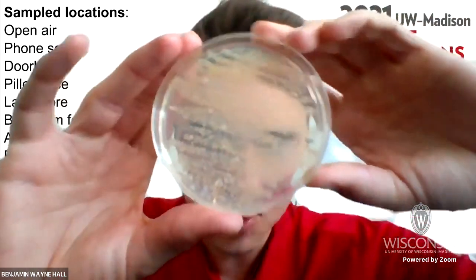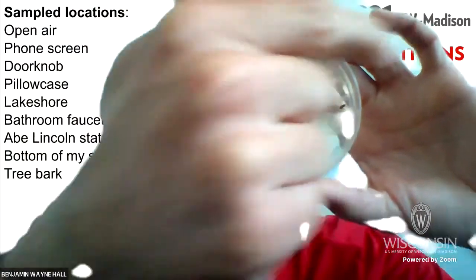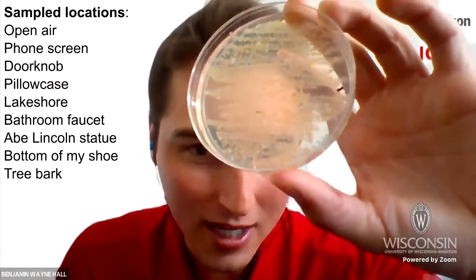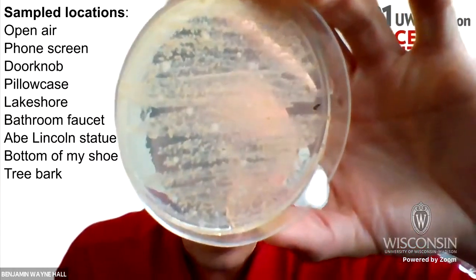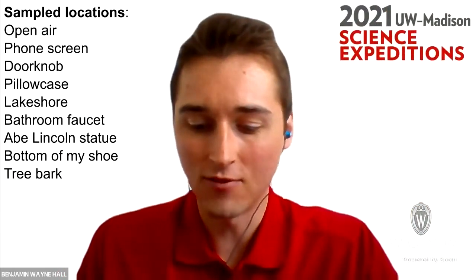And what I think is especially cool is you can actually see where my Q-tip went. So you can actually follow the Q-tip strokes back and forth and back and forth on this plate because the bacteria show you where that was. So Lakeshore definitely had the most bacteria out of all of the samples.